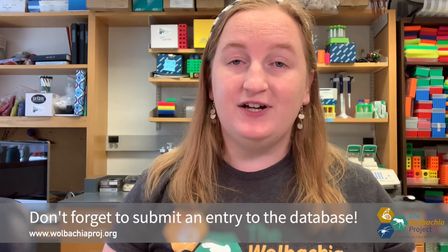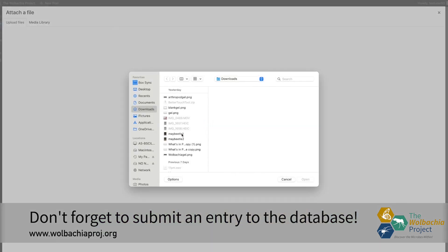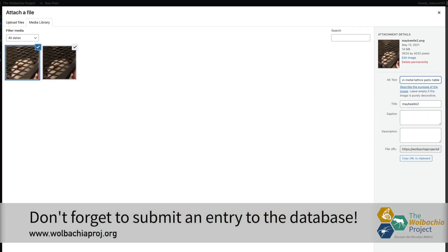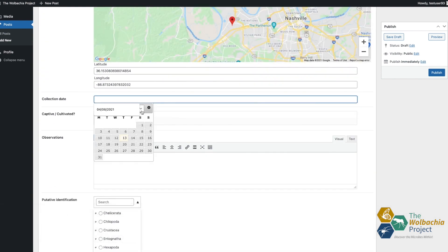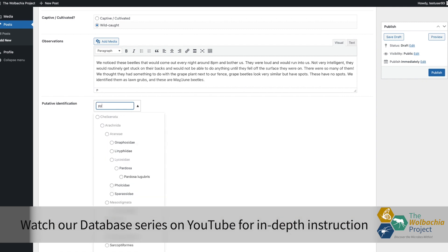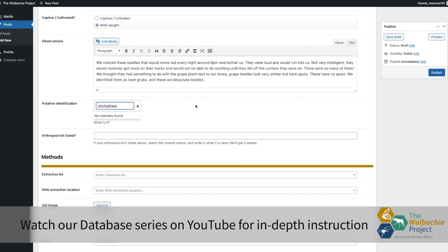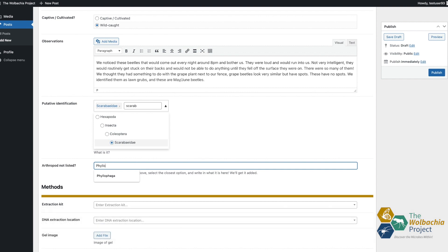Once you've collected and identified your arthropod, you can start filling out an entry on our database. Our database is an online repository to share your data and information with other scientists, students, and Wolbachia researchers across the world. Once you fill out the observations page, you can just publish that as is and always go back to it to edit as you go along with this project. Once you're done, I'll see you in Lab 2, DNA extraction.